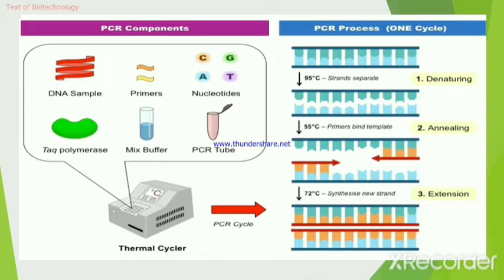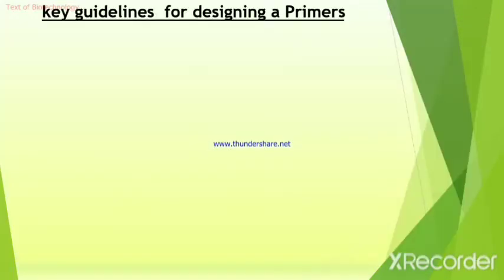The main goal of this video is to show you how to design synthetic primers to amplify a region of DNA on a sequence of interest. When designing primers, there are some key guidelines you should follow to be confident that they will amplify your target correctly.